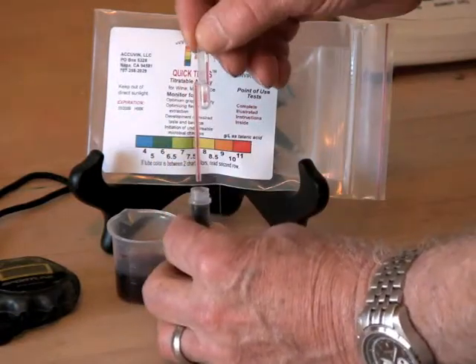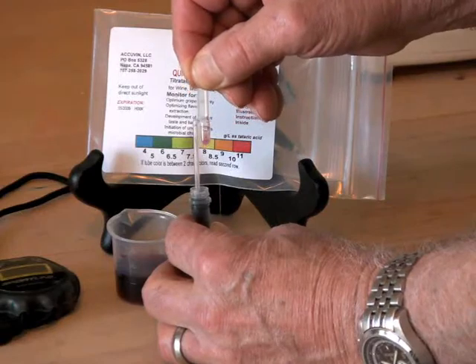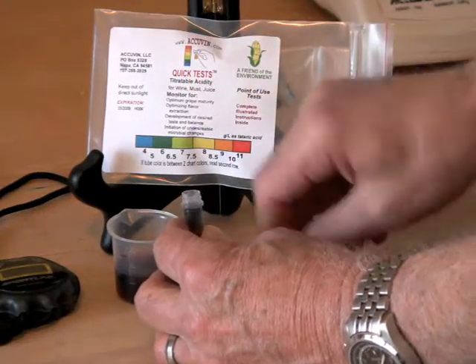Wipe the outside of the sampler tip, place the tip into the reagent, squeeze once, and withdraw the sampler before releasing the bulb.